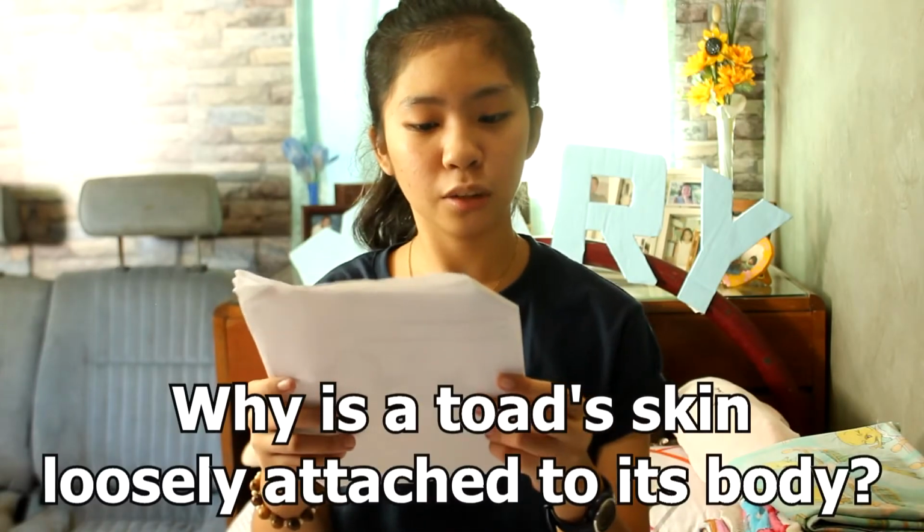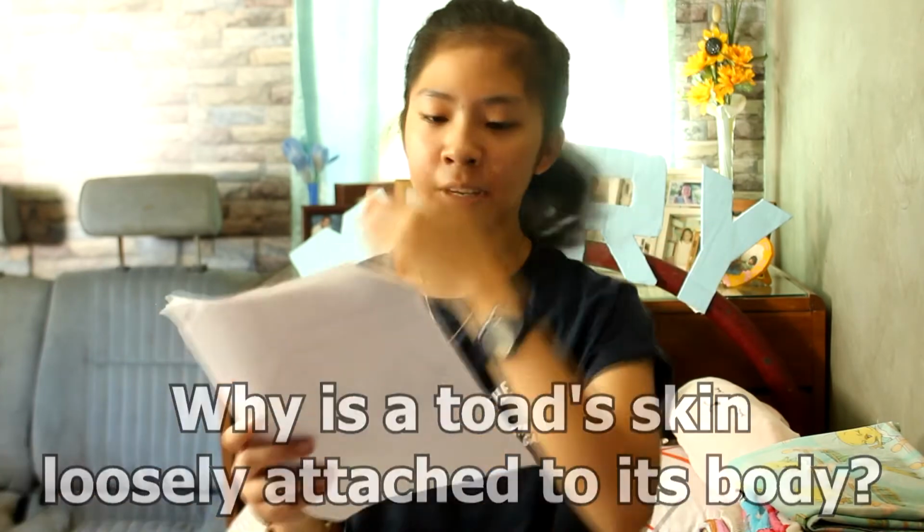So, we have a few questions here sa atong lab journal. Okay, so atong first question is, why is a toad's skin loosely attached to its body? So, it is to protect the inner organs of the frog and prevent tearing. It is also because they carry gases. So, mao na siya. Ang source ani kay quizlet.com.